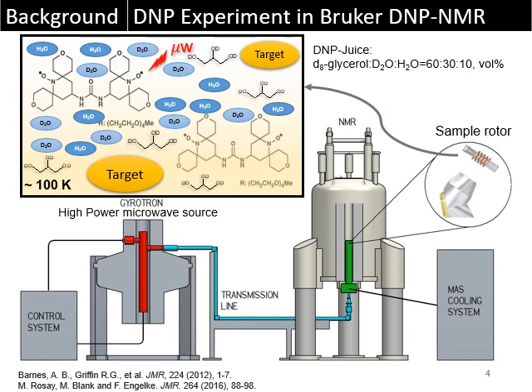water. During a DNP experiment, microwave first irradiates the free electrons, and then the polarization transfers from the electron to the nearby hyperfine coupled nuclei, for example protons. Then through the proton network, polarization diffuses to our sample. A lot of effort has been devoted to improving DNP enhancement under high field conditions. Broadly speaking, there are three pathways: instrumentation development, improving sample preparation methods, and improving DNP theory. My talk today covers all three aspects.